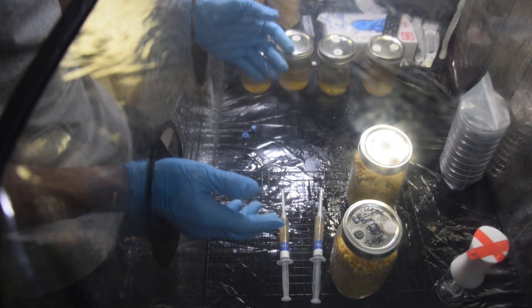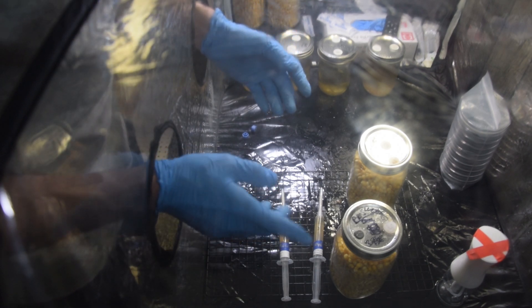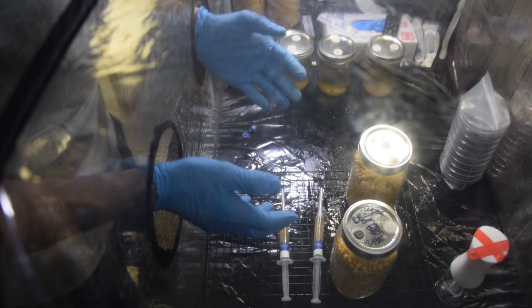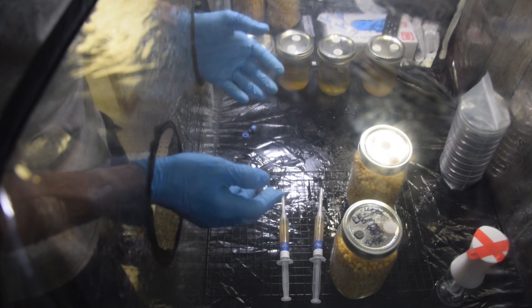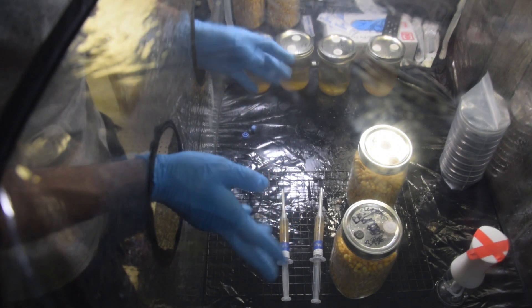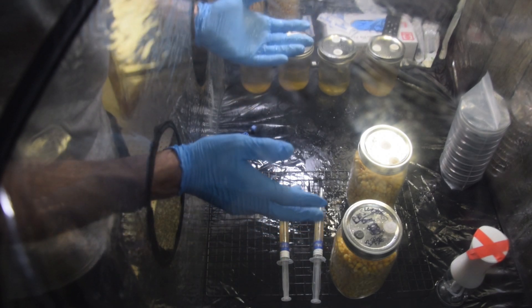I'll check on them every couple of days — I usually take a peek, I know you're not supposed to. Two weeks, I expect these to be done. We'll probably do a break and shake midway. I'll probably give them a full three weeks, and that's if these liquid cultures are good. So we'll see — it's all up to that.